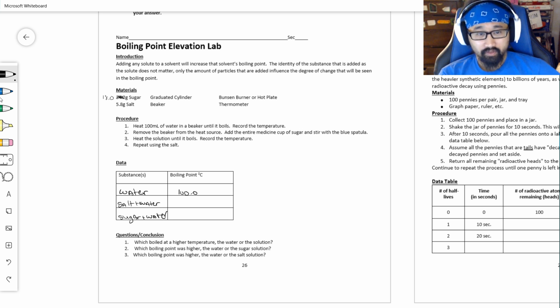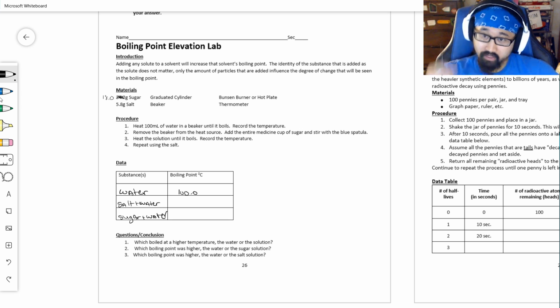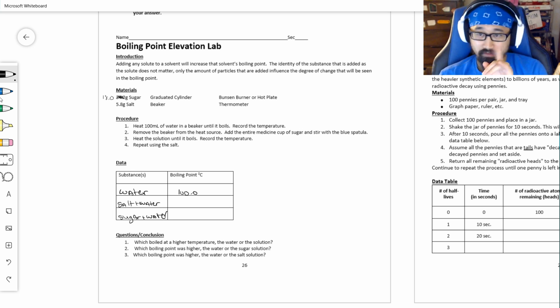What folks found for salt and water: we added 5.8 grams of salt, which is not a ton of salt. It's more than a pinch, but I think it's less than a teaspoon. So we measured out 5.8 grams of salt, poured it into 100 milliliters of water, stirred it around, threw it on top of the Bunsen burner, and boiled it. And there's an interesting thing. Some people have been told that putting salt in water reduces the boiling point and makes it boil faster. Neither of those things is true, but more on that in a moment.